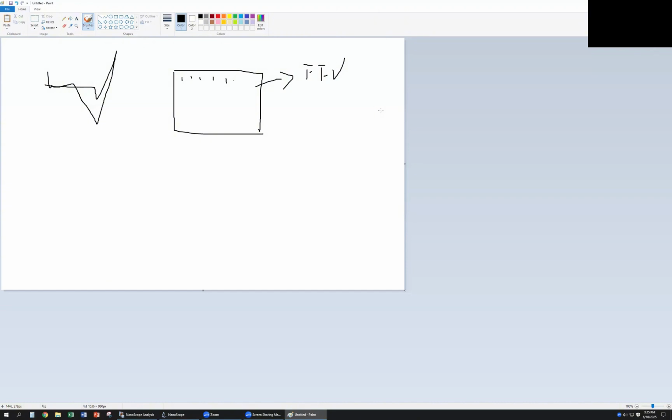That's fast. It also gets the force curve at every point, just the scanner movement is like this, not like this. So that means for this one point. And another one is called force volume. This one is for imaging. So this is for imaging. We have force volume and we also have PeakForce QNM.